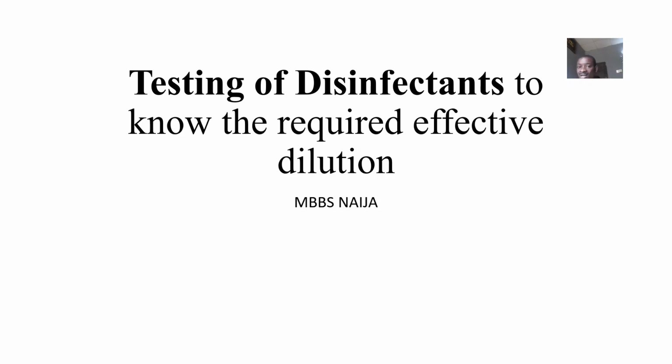So we are looking at how you can test disinfectants to know the amount of that disinfectant that will be so effective. So you can say, to know the required effective dilution. Okay, so I want to use a disinfectant, so I want to know the amount of this disinfectant that would be very effective.